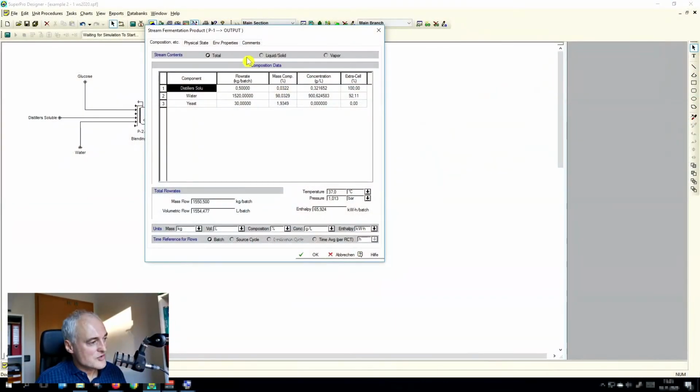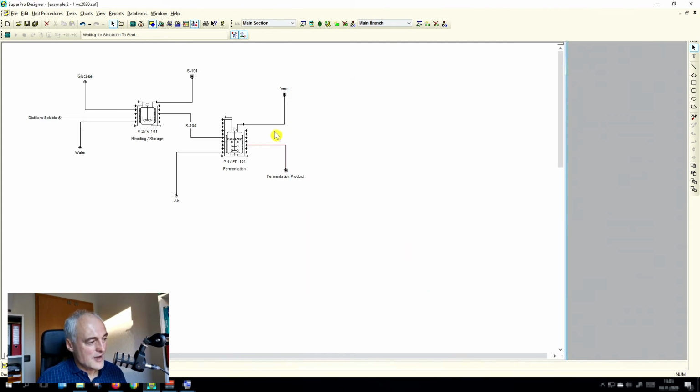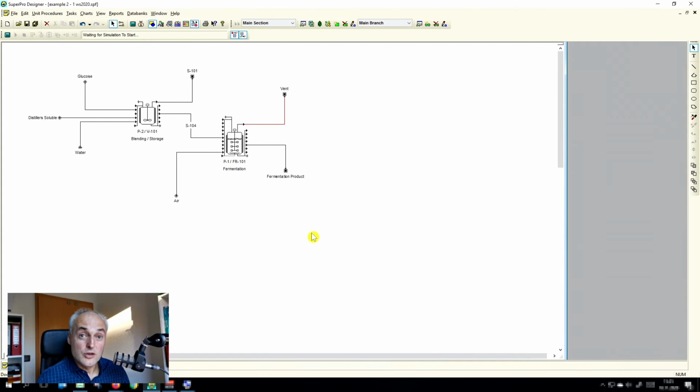Okay, so now we double click on the fermentation product, and you see that there is no change, and this is good. We have exactly the same content here, and also here the same content. Now everything looks cool. So is everything fine?